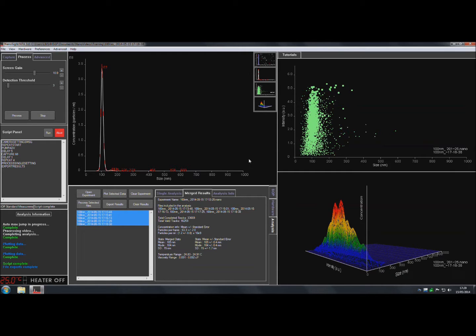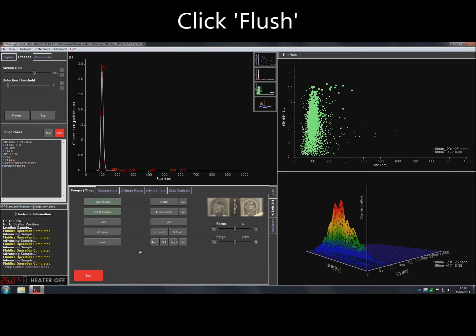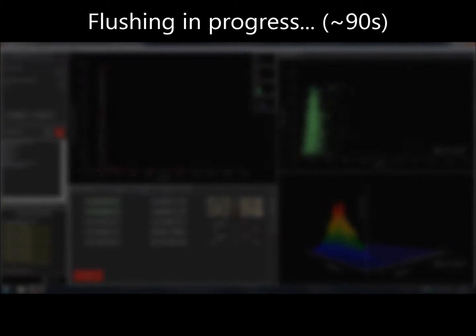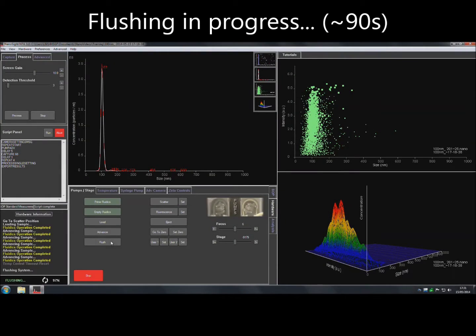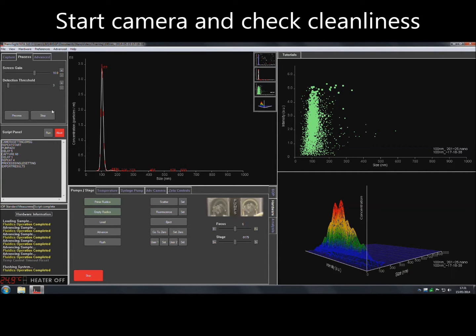When finished with the previous sample, remove the tubing from the sample vial and insert it into the waste port, then navigate to the Hardware tab and select Flush to remove the sample from the tubing. When the flush has finished, click on Start Camera to check that the sample chamber is clean.